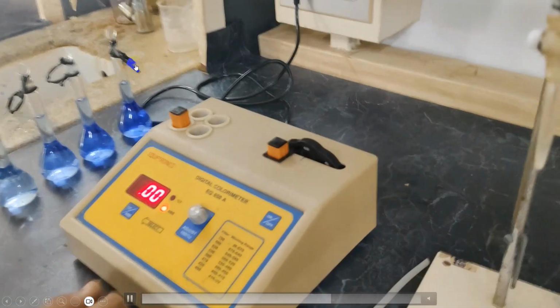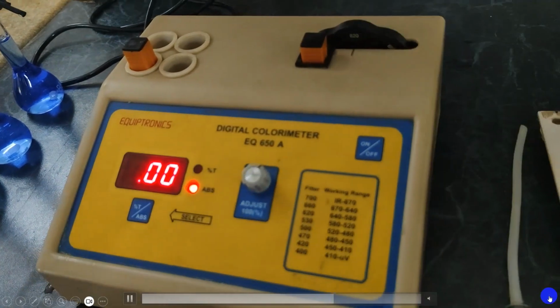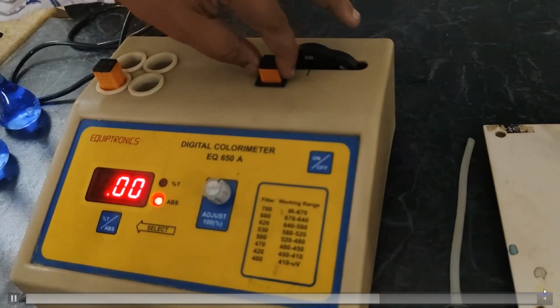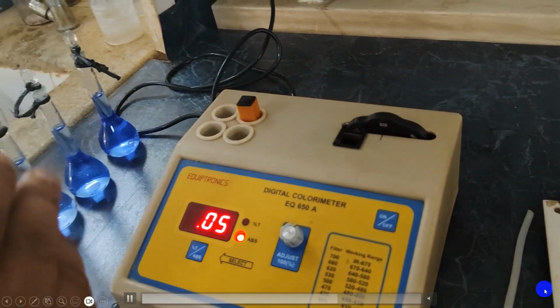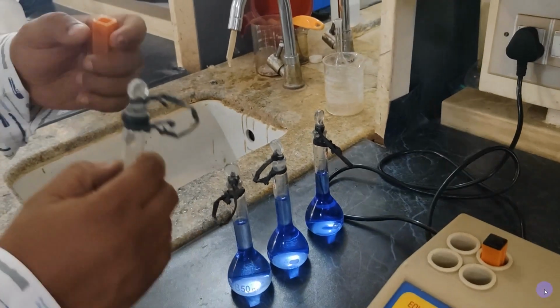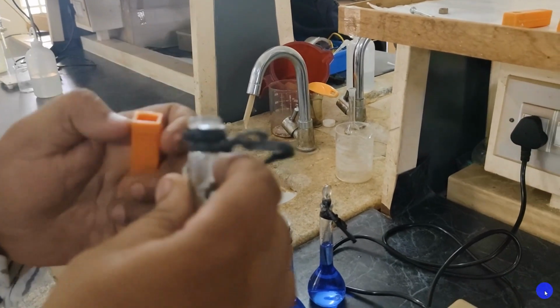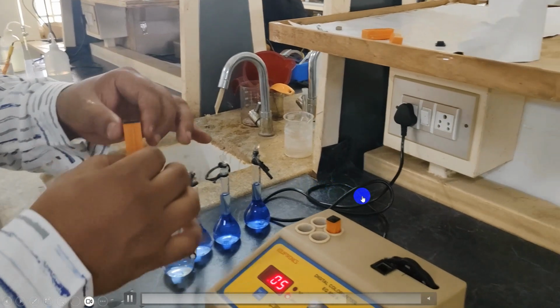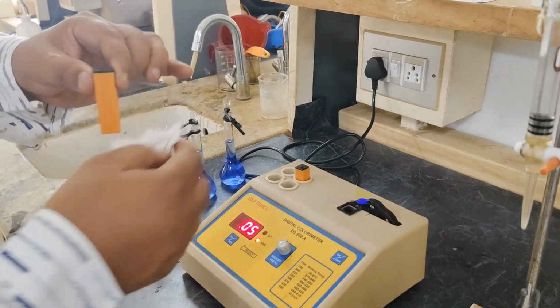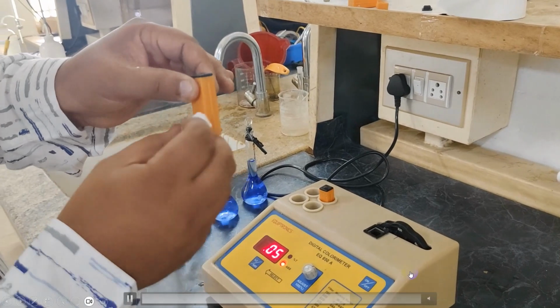Ensure the 0 absorbance. So it's already 0. If not, set the instrument to 0. Now place it back in the cuvette holder and then fill the other cuvette with the various samples. Place the solution, wipe the cuvette thoroughly and place the solution in the sample holder.